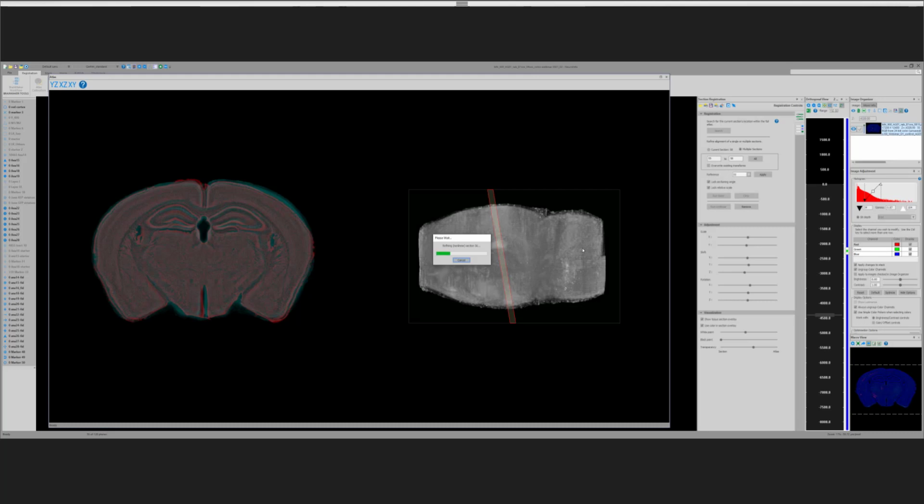It's doing it automatically. Chip, can I ask, per day or per week, what is your workflow in your particular lab for how many brains you can get through at this resolution and this rostral caudal extent? Well, going through this part, the cell detection can take an hour to 2 hours.